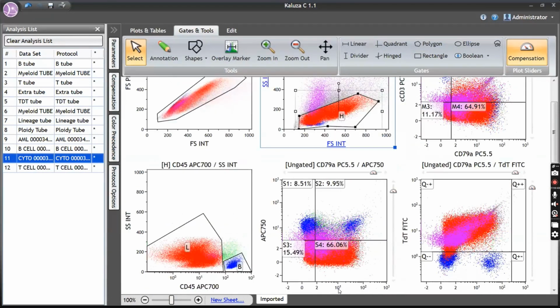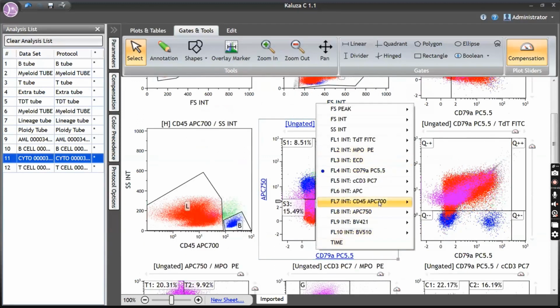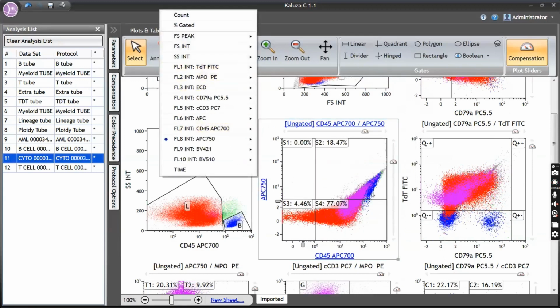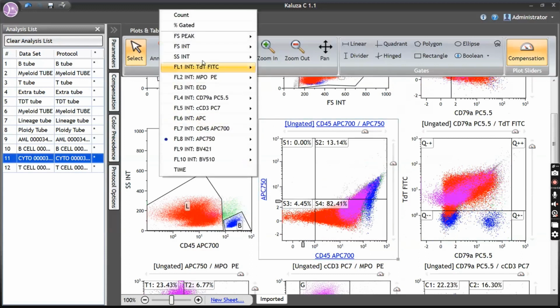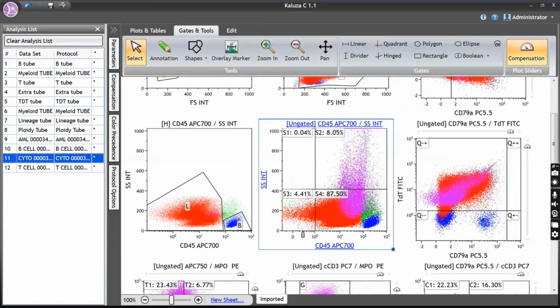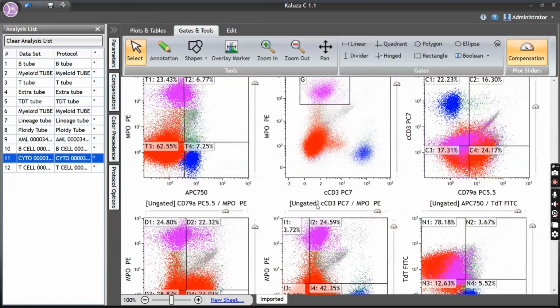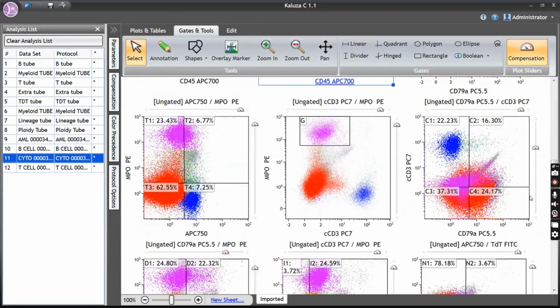You can see with side scatter CD45, ungated. Autofluorescence, too much. Okay, so this is looking like some granulocyte population. So you have MPO internal control here, but the blast is not reaching up to them. So it's negative for cyto-CD3 and MPO.